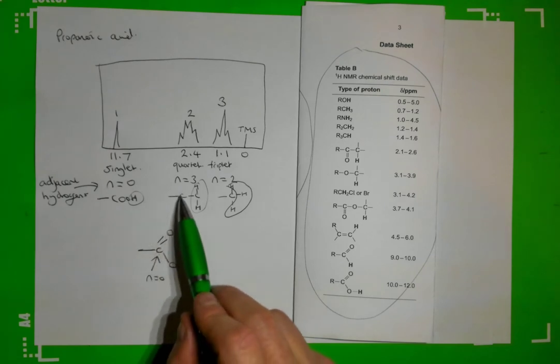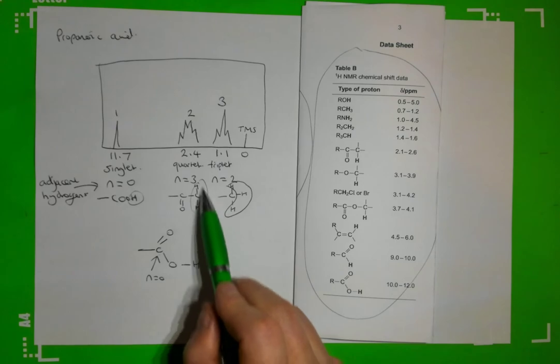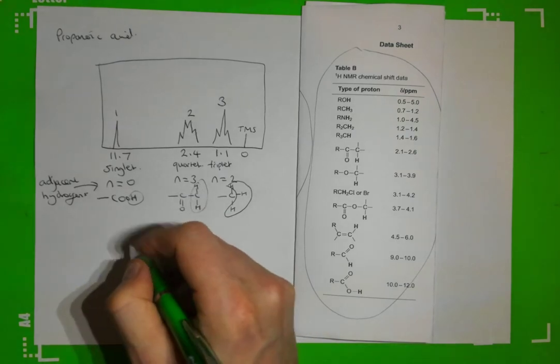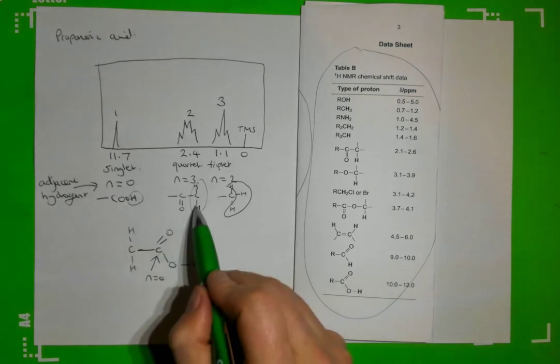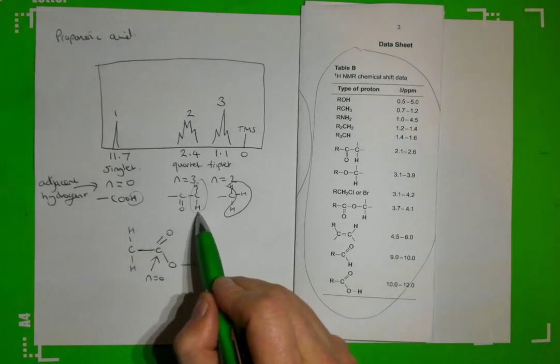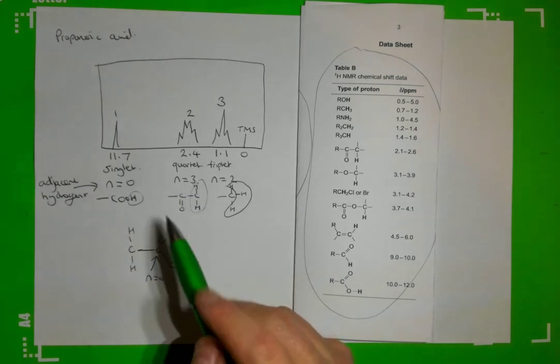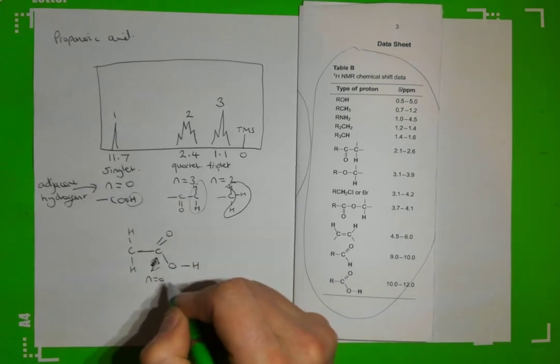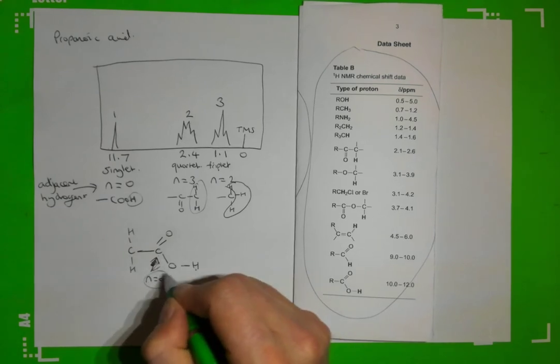Then we've got this C double bond O, and we've got a CH2 here. So I'm going to write down my CH2 there, which corresponds to this one here. Now we know that N is equal to 3. Oh, I should label that. Sorry, N is equal to 0. It's this hydrogen we're talking about.